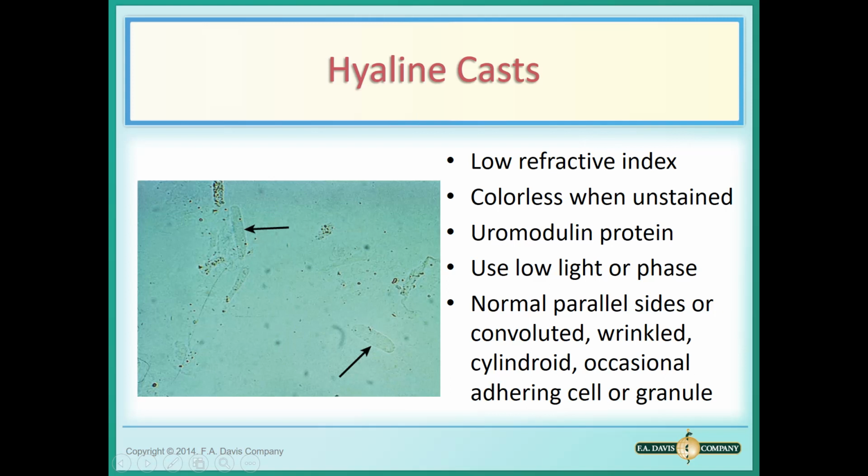Let's look on. This is a cylindroid right here. See how it's parallel on the sides? But see how it tapers off to the edge? That's a cylindroid. See how it's the same? It looks the same though as a cast, right? Because they are.